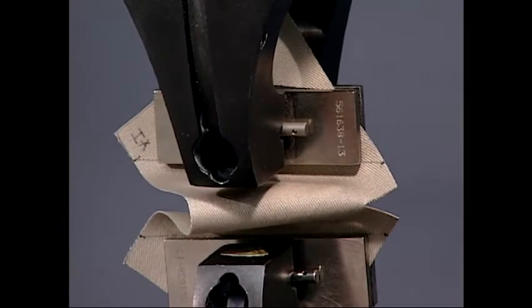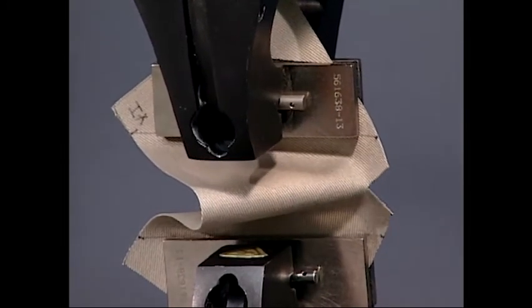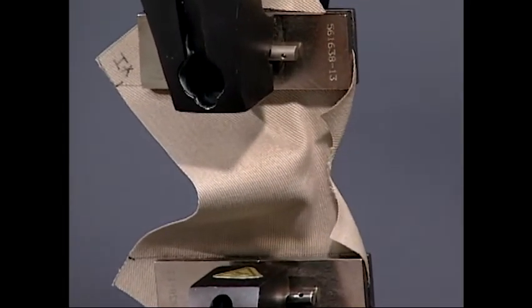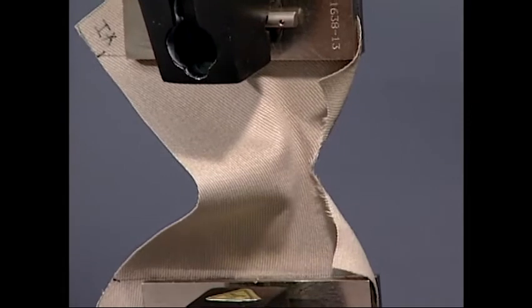Trapezoid tearing strength is expressed in pounds force. The value may be an average of the 5 highest peaks. Peaks are the result of yarns bunching up in the test, offering a higher resistance.